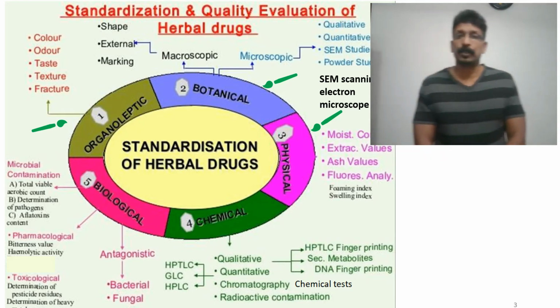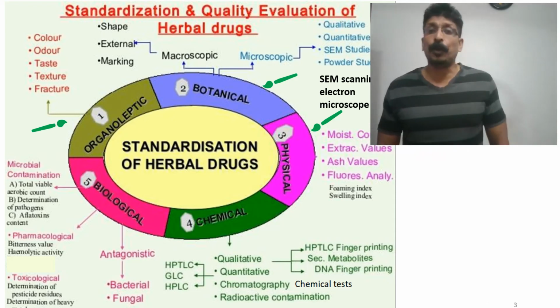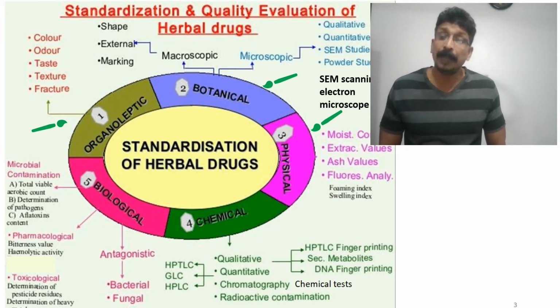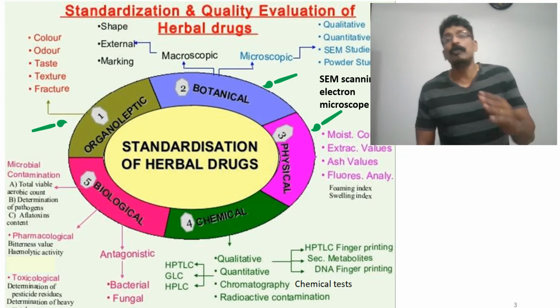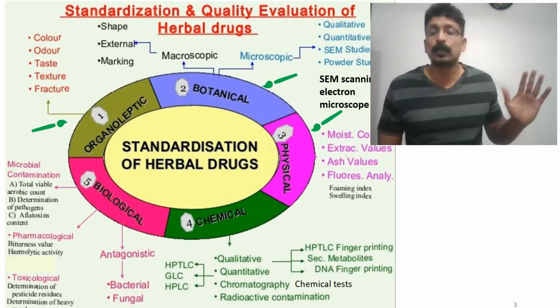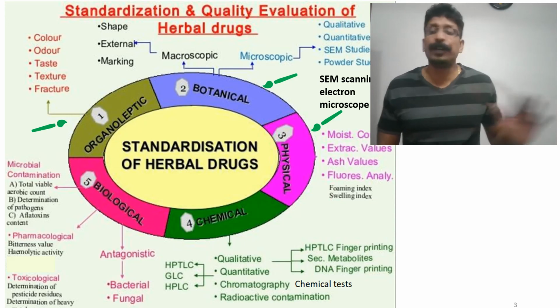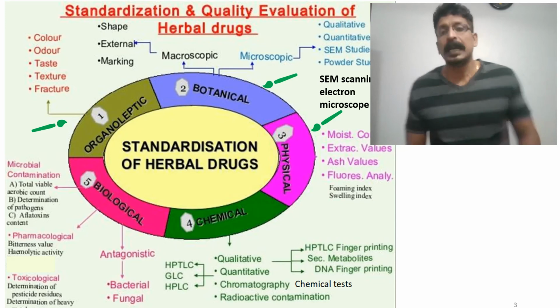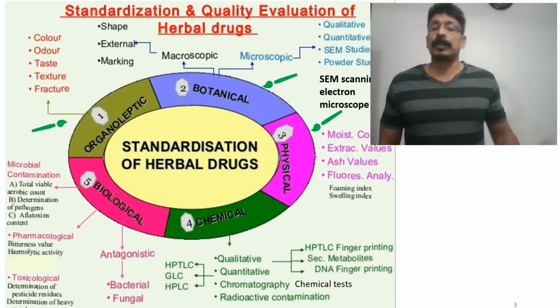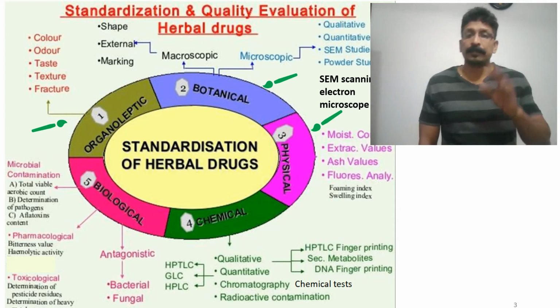So now, as I told again and again, two things I am going to show you about the HPTLC fingerprinting. What is HPTLC fingerprinting and what is meant by DNA fingerprinting? When you see this and when you know these two, it will be more than interesting and sufficient for you, and it will be helpful for my students in their future research as well as future jobs and many other things. Because you know, HPTLC is not present in our college, and in future they may be bringing it to you.